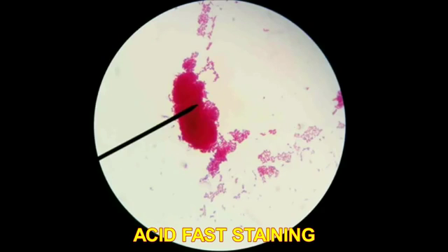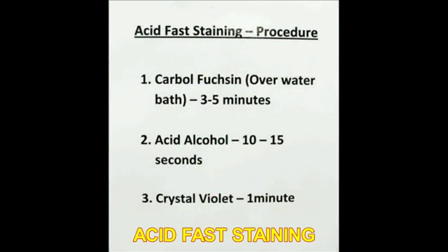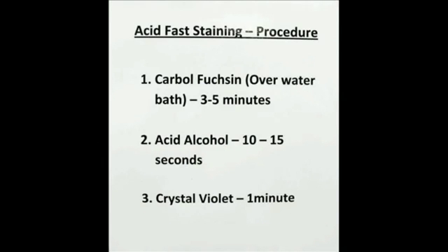After staining, this is what our acid-fast cells will look like under the microscope. Hot pink, and they often stick together because they're waxy. The second step will be the decolorizer, acid alcohol, which will run down the slide for 10 to 15 seconds.